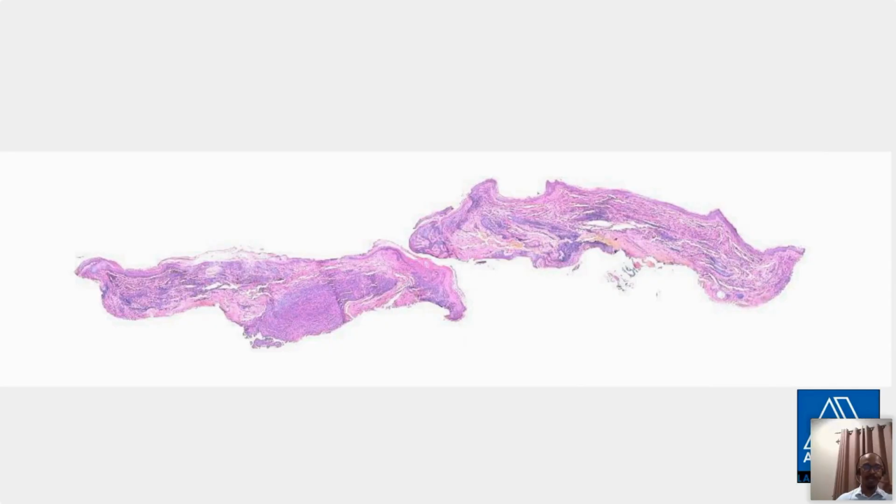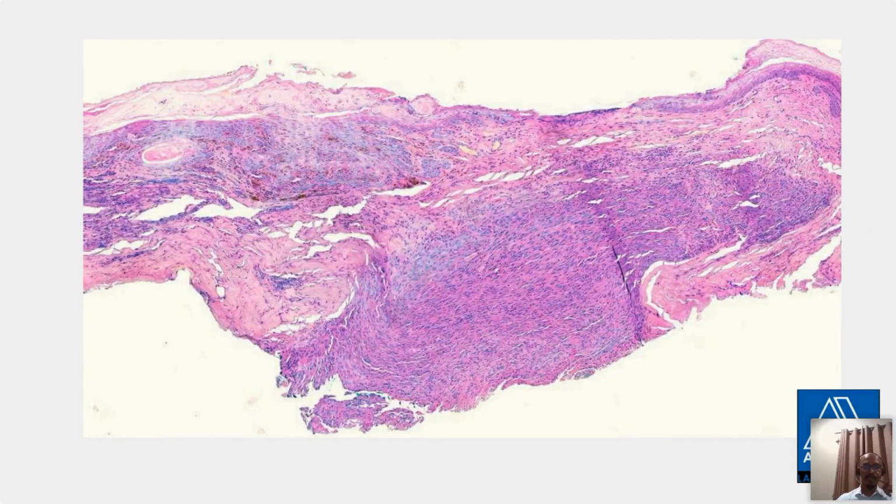Okay, this is another lesion which was left to dry out a little bit on the table before it was actually put in formalin. Again, the architecture is slightly distorted, but we thought this must be the lesion here, and we were happy that it seems to be a little bit circumscribed. We couldn't quite see what was in the epidermis.